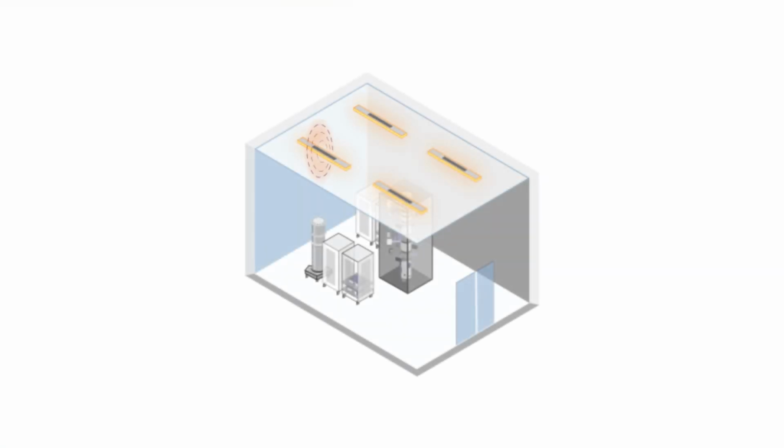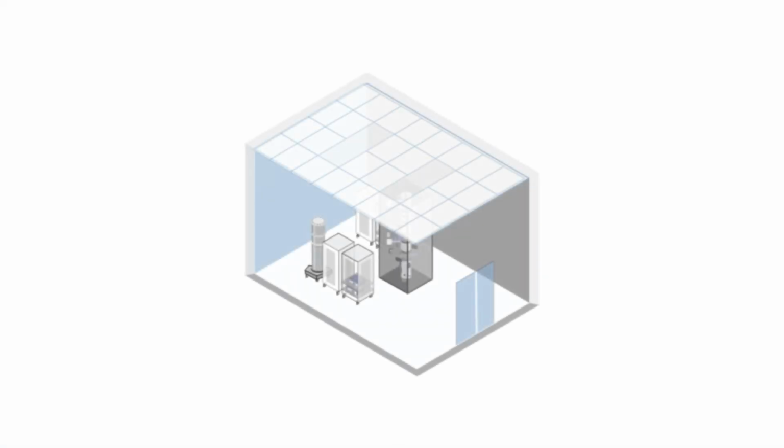The second type, and this was more of a problem in the past than it is now, is lighting. In the 80s and 90s, where magnetic ballasts were used for fluorescent lights, these magnetic ballasts were a significant magnetic field source and caused significant issues for imaging performance if you put an electron microscope in a room with these old school magnetic ballasts. Nowadays, with the advent of modern LEDs, this isn't as much of a problem as it was before.